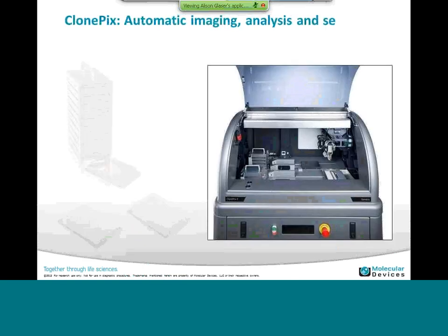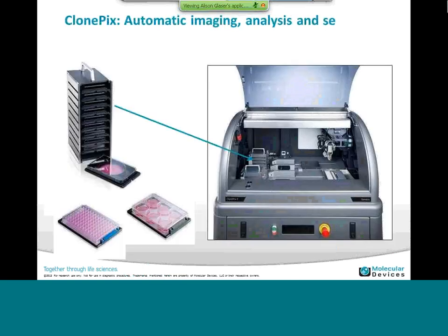Up to 10 source plates, or the plates containing the cells in semi-solid media, and 10 destination plates of liquid expansion media can be loaded at once. Utilizing the stacker cassette visualized on the left, plates are placed in trays with a magnetic backing. The magnetic backing secures the plates, and then the stacker is automatically raised and lowered in the system while one plate is removed for imaging and picking at a time.